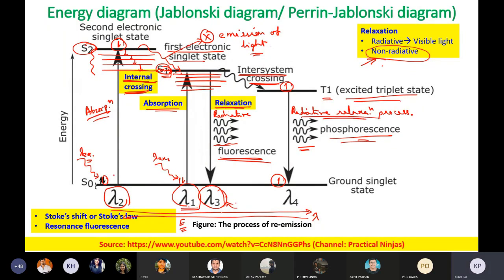Okay, now herein if you see the change in the wavelength when there is a re-emission, that is due to the Stokes shift or Stokes law. Okay, that phenomenon is called Stokes shift or Stokes law.